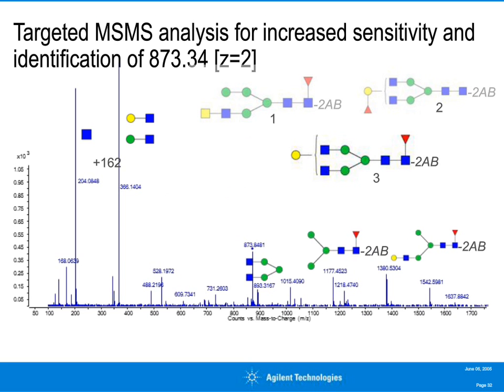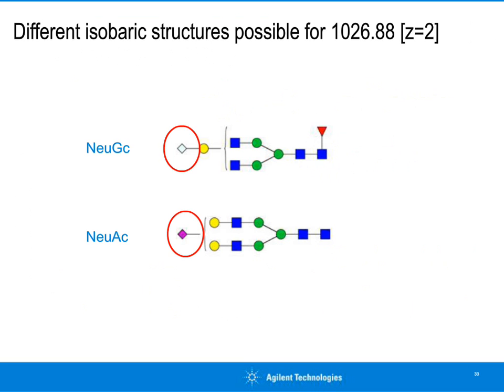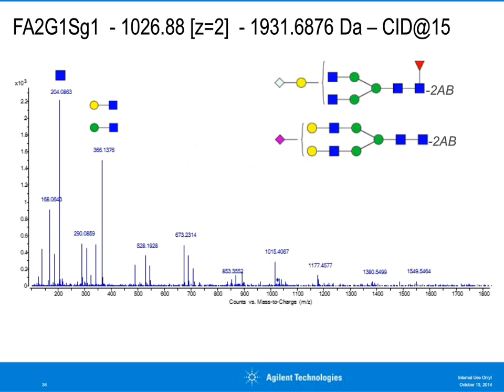For another detected glycan mass, 2 possible structures are proposed by ExPASy containing different sialic acids. To identify the correct one, the MS-MS spectrum of this mass is analyzed in detail. The MS-MS spectrum shows a strong fragment ion signal at 308, representing NeuGc, and 673, representing NeuGc attached to galactose and GlcNAc.